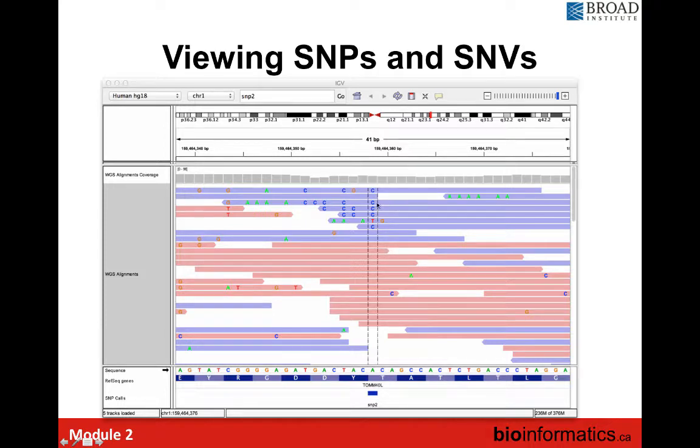And you observe as well that most of them are at the end of the read, as Jared described earlier. The ends of the reads are more prone to error, and that is one of the patterns you can see here. So you would not trust this being a SNP for C here.